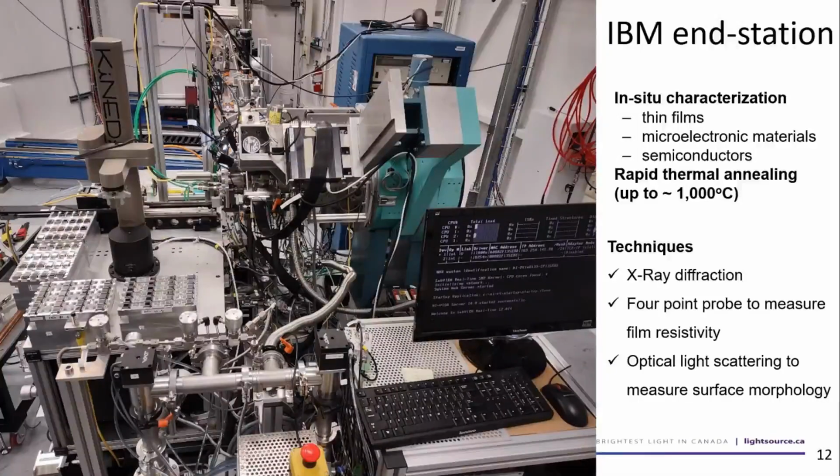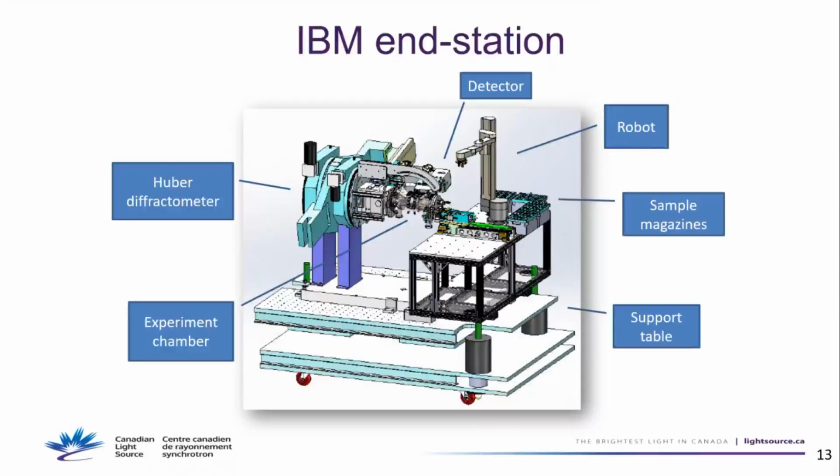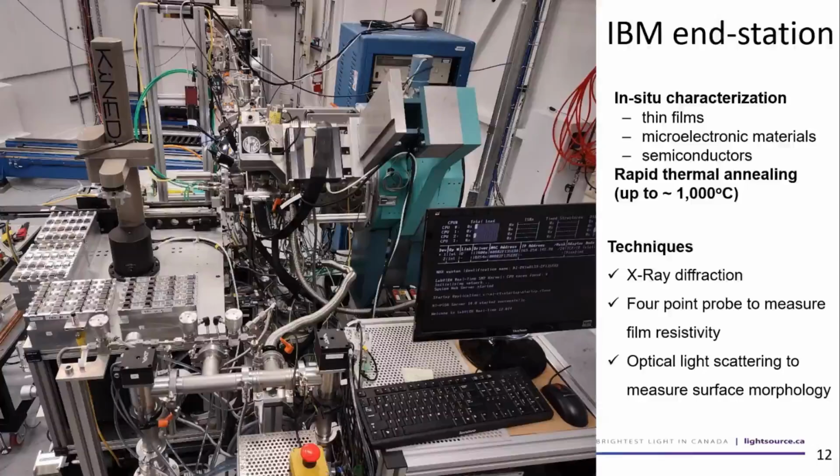We have a station from IBM in the lower energy Wheeler beamline that you might remember. It looks about like this. This is the station here. It's very crowded, but it has a diffractometer, the Huber diffractometer. They use it to characterize thin films, but microelectronic materials are full of thin films, very, very small dimensions.